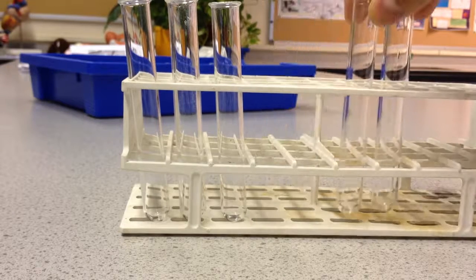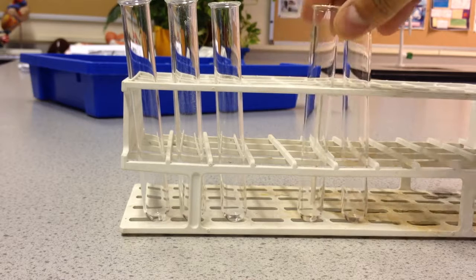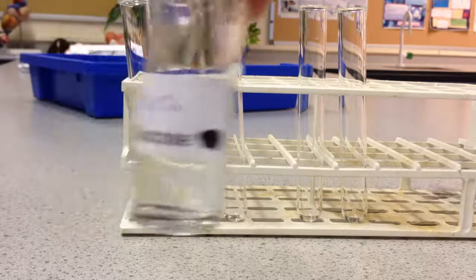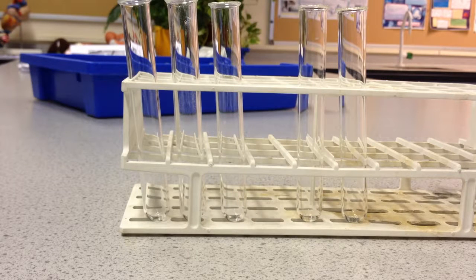So if we start off with 2 tubes, okay, and in each we will add a solution to test for. So in one, I will add some glucose, which is a reducing sugar. And in the other, I will add some water.